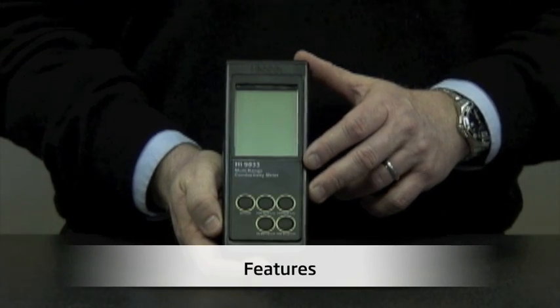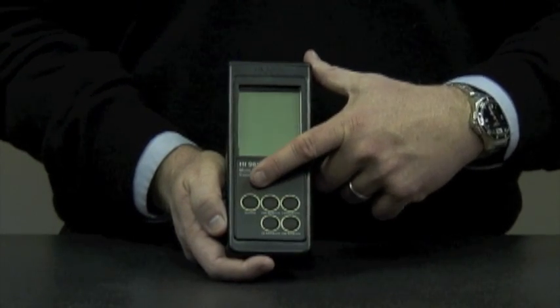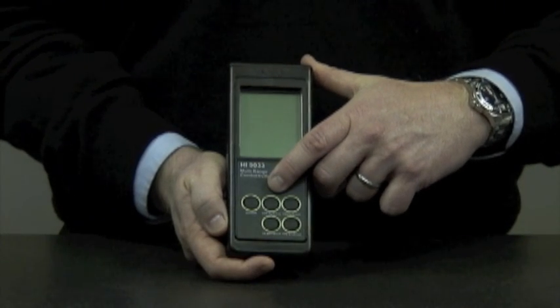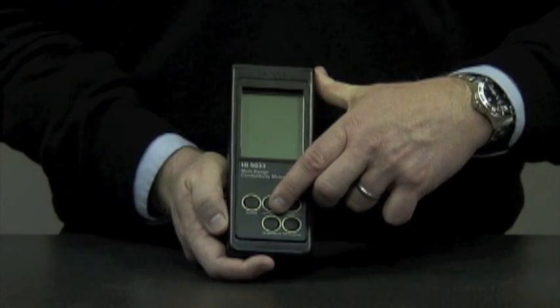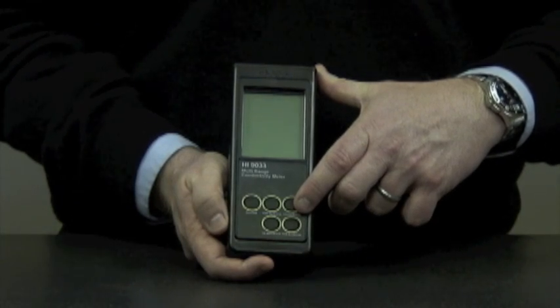Let me introduce you to the features of our unit. We have a large LCD display, an on/off button, and four measuring range buttons: 0–199.9 microsiemens, 0–1999 microsiemens, 0–19.99 millisiemens, and 0–199.9 millisiemens.